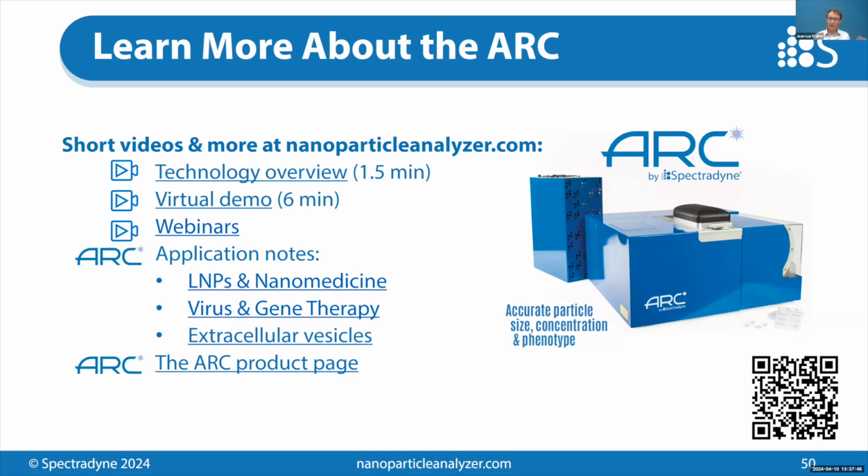So encapsulation efficiency is what you get from the RiboGreen assay, right? Which tells you the amount of your input RNA that gets encapsulated in your particles. And so that can be very high, even if it's only going into a few of the particles, right? So the RiboGreen assay does not tell you the distribution of encapsulation. We measure the distribution of encapsulation, but we do not measure the free RNA in solution. So we're measuring something different than encapsulation efficiency as normally thought of in terms of the RiboGreen assay. We measure the RNA, the loaded versus empty, and we are working on the calibration to tell you the number of micrograms of RNA per mL or per particle, but it's coming. Okay, so be patient, it's on the way.